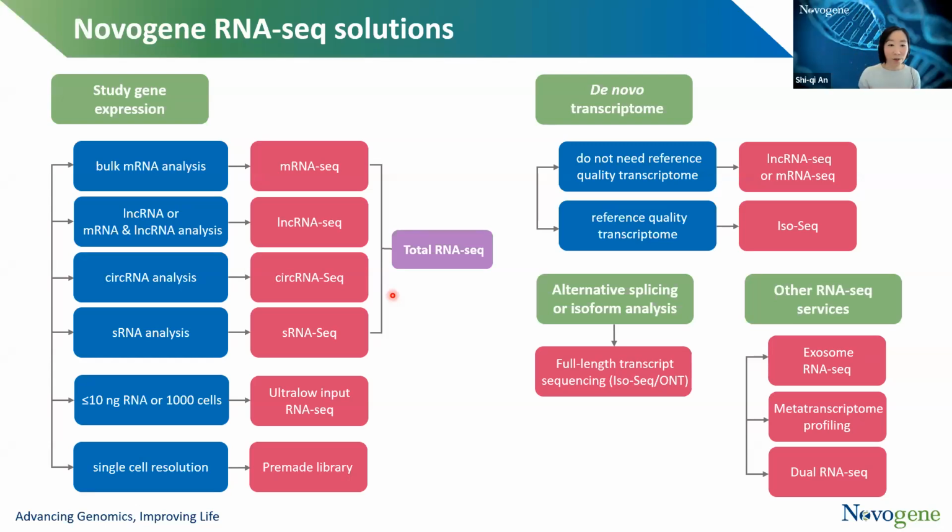Yes. Okay. So that's actually something we can do. We can treat this as a bioinformatic analysis only project, and the quick answer is yes. But we also will need to know what platform you sequenced on, the data amount you have, and whether there is a reference genome available, or whether we need to do de novo assembly. So it depends on the situation. The quick answer is yes, we probably can do this, but we will need more information to really evaluate the project and decide which would be the best approach. I hope that addresses the question.